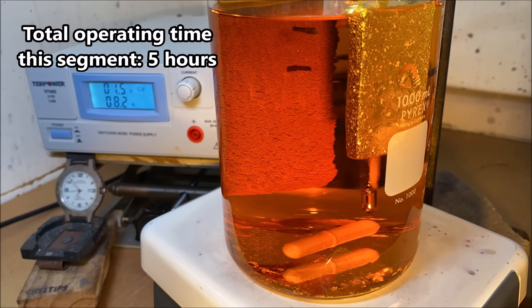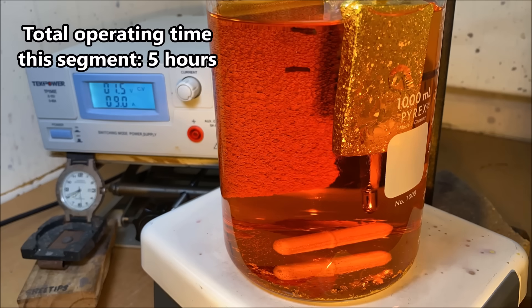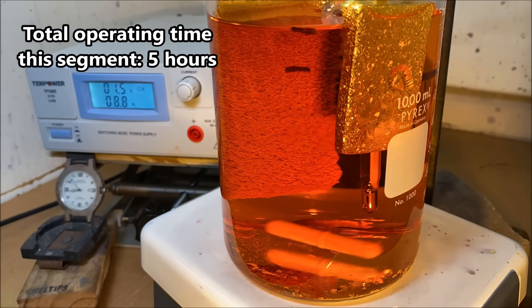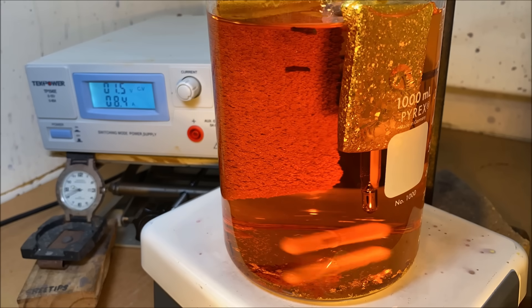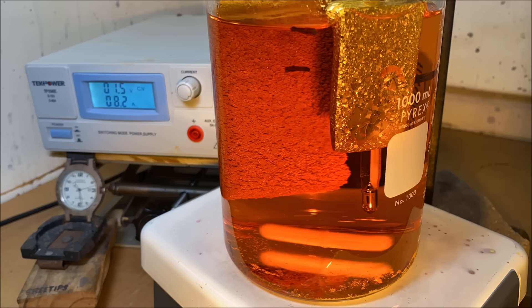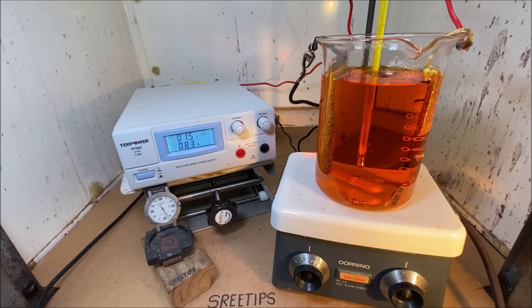Here I'm adjusting the cell around so we can get the best view of the anode bar corroding away. I had to take out a little bit of the electrolyte because it was starting to touch the little hook that I'm using to suspend the anode bar in the beaker — I didn't want that hook dissolving away and dropping the anode bar and breaking the beaker. It's getting late, I'm going to have to wrap this thing up.